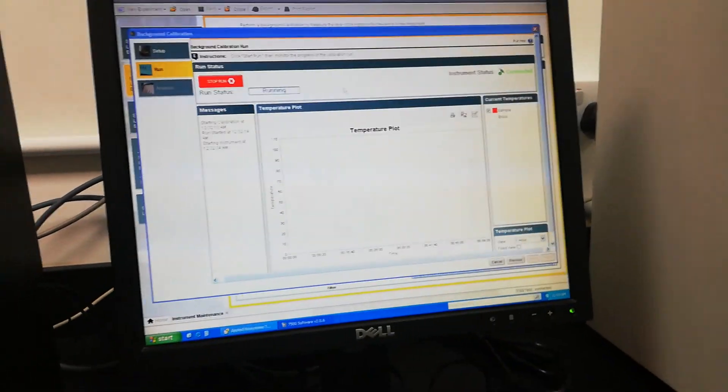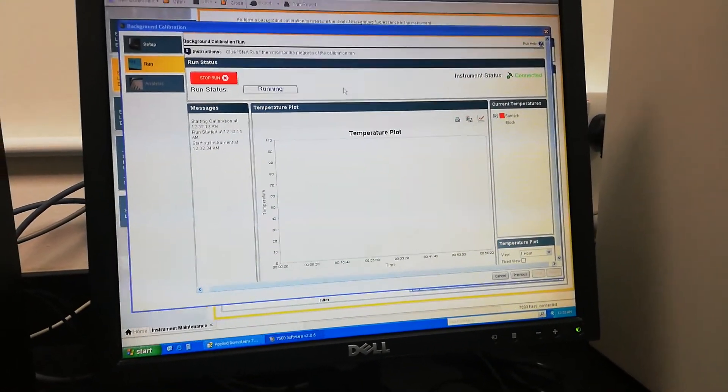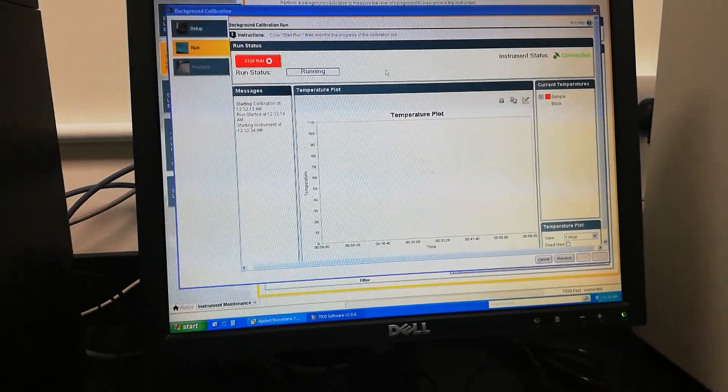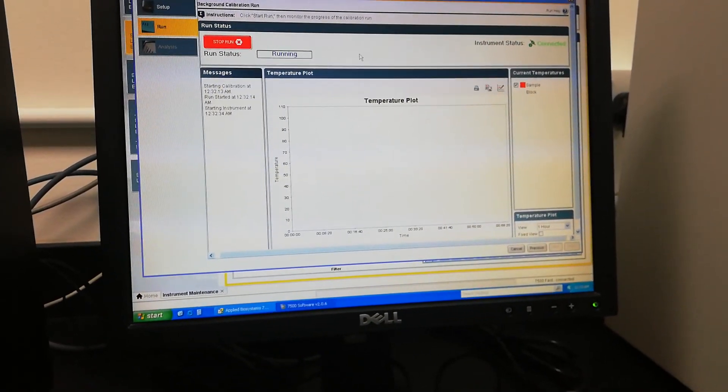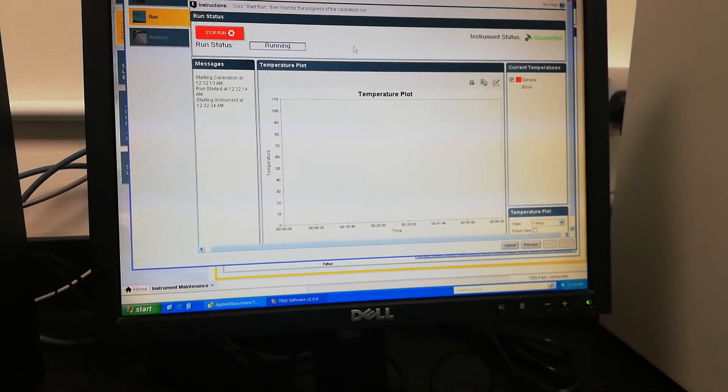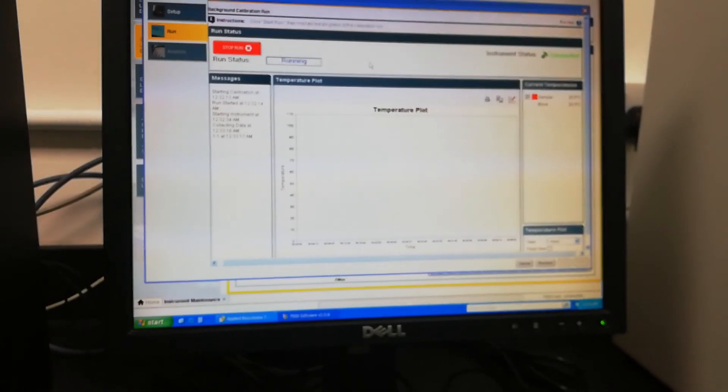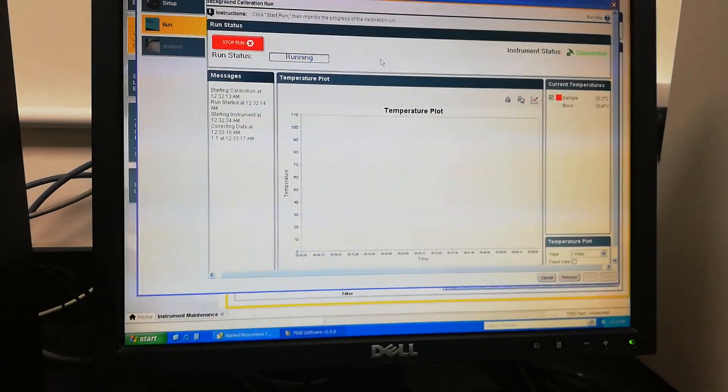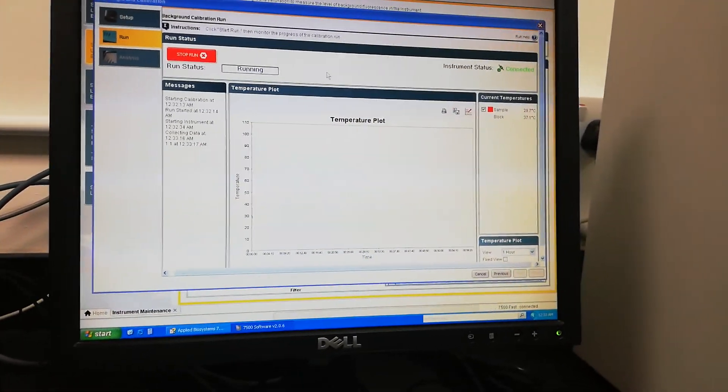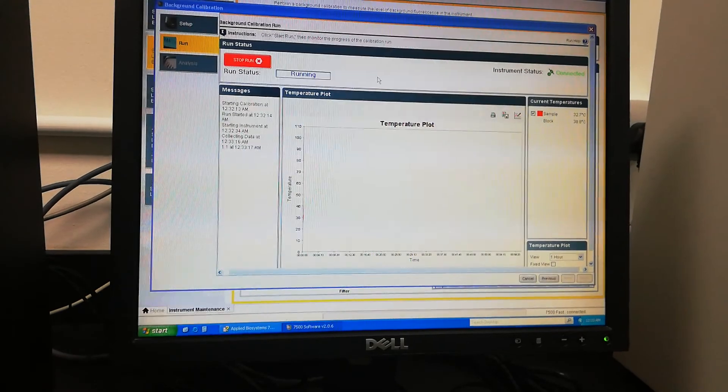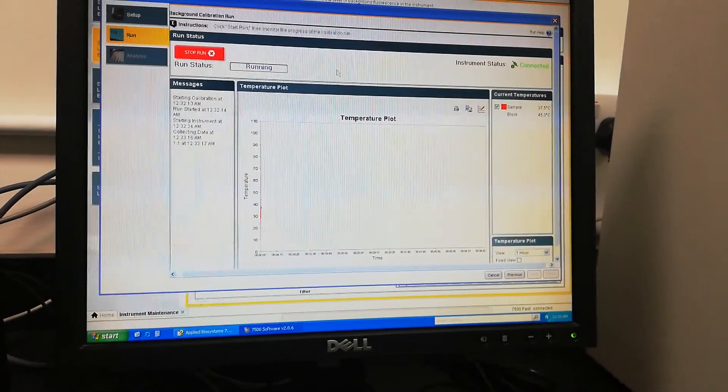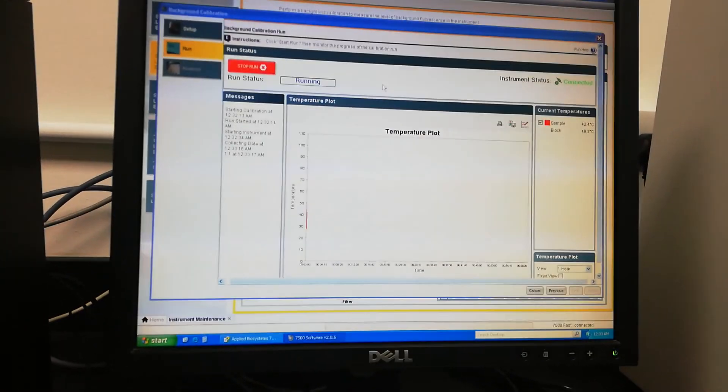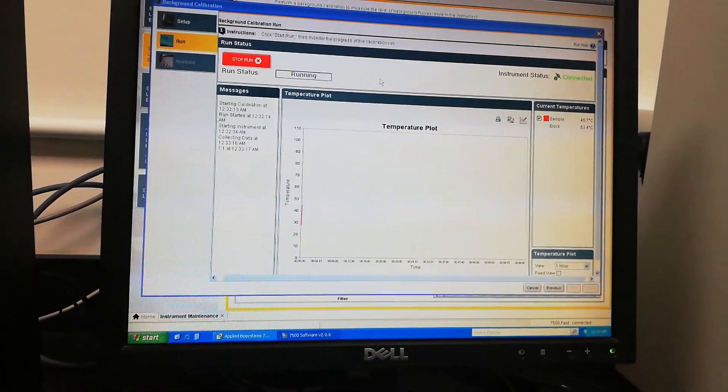Here I just started this background calibration. I selected the background calibration and then did the sequence of next, next, next, and finally this wizard came. After keeping the plate in the folder and while starting the machine, I just pressed the start run button.